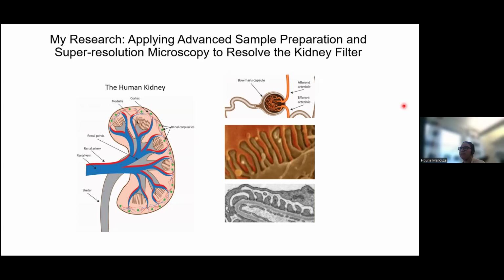Clearing. Skin, I cannot tell you from the top of my head actually. I don't have any experience of skin clearing, and it's quite varied from one tissue to another. So maybe you'll have to have a look at the literature. I'm sure there are protocols out there for clearing skin.